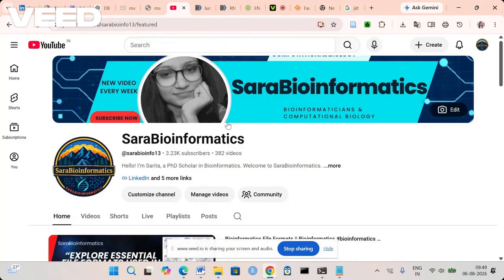Now let's begin. Welcome to episode 9 of our NGS Bioinformatics Master's course. In our previous episode, we learned the basic concepts of molecular biology: DNA, RNA, gene, chromosome, genome, and next generation sequencing. Now we are starting the practical part of this course. Today's lecture is very important because every NGS project starts with raw sequencing data.